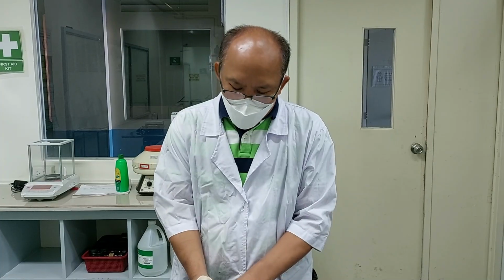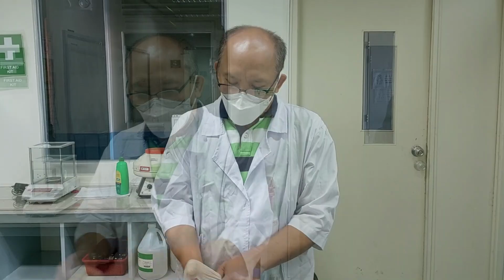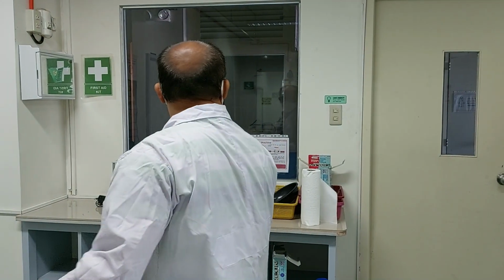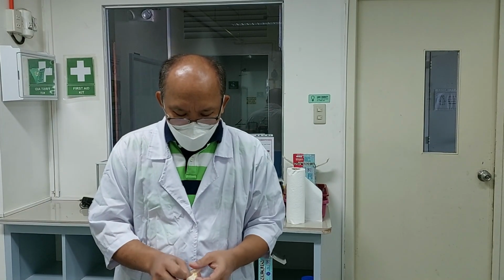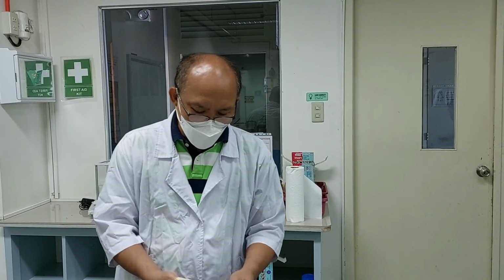And for this, the second part of the test, you will know how to identify the presence of alkene and alkyne. By the first one, as we discussed in the lecture, we have the decolorization test.